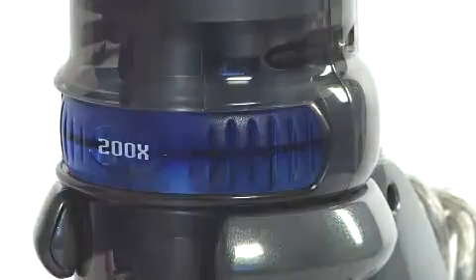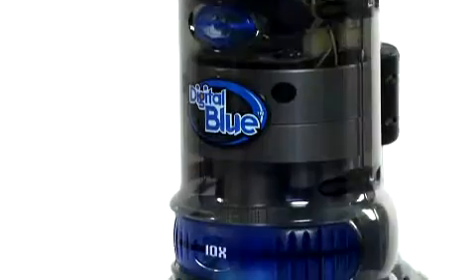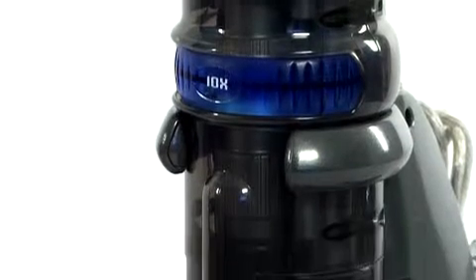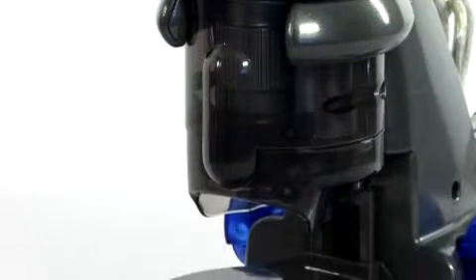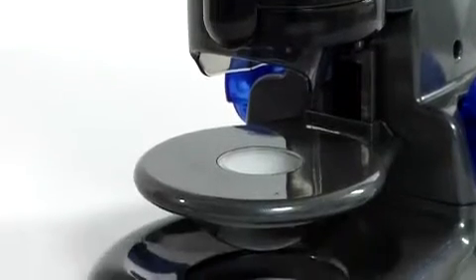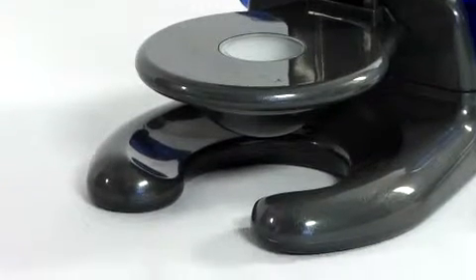Share your findings with your friends, family and the world. If you'd like your children to have fun while learning, the QX5 is the perfect solution. Enhance your child's curiosity and imagination while they explore the microscopic world. I'm Kevin, from ShopTronics, urging you to give the gift of fun and education with the Prime Entertainment QX5 Digital Blue Computer Microscope.